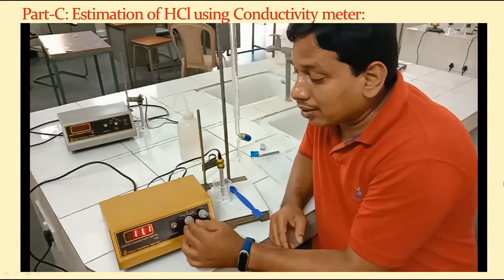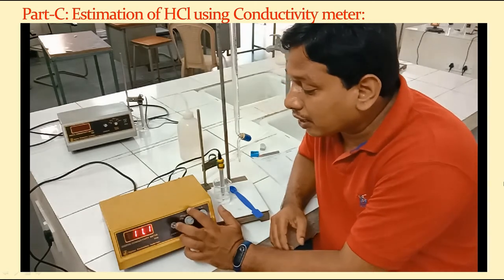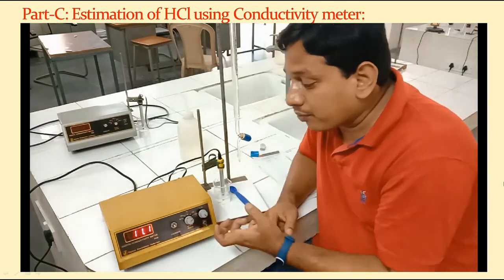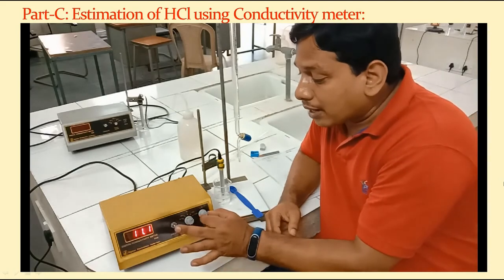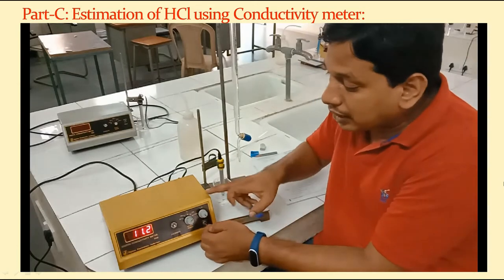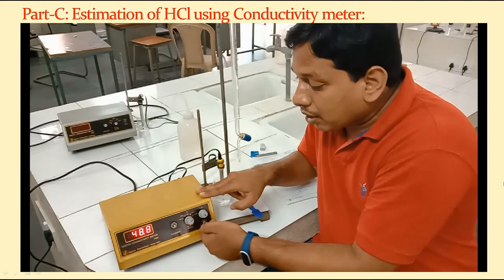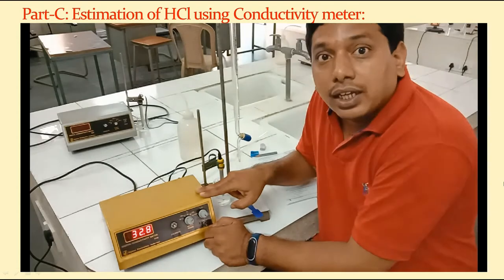The second one has the scales, different ranges on this instrument, like 10, 100, 1K, 10K, 100K. Depending on the type of solution we are using, we can set the range using this knob. Another knob is to set the cell constant. We also have a button here where we can set two modes. The upside is the check mode, and downward is the read mode.